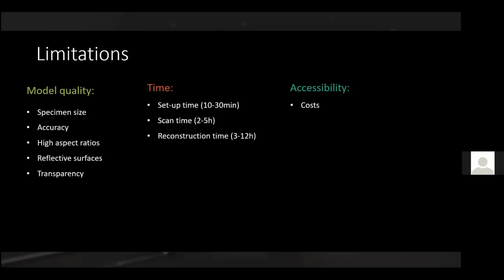And of course, also in terms of accessibility, it still costs some money to make it, right? I think 180 quid is roughly the figure at the moment, but it's still some money. So not everyone has that amount of money. And it still requires some equipment to have access to. Although it's rapid prototyping, and many institutions will have access to a 3D printer and a laser cutter, not all will. So if we really want to make this accessible as broadly as possible, that is something that stands in the way of that.